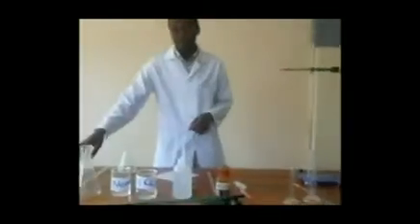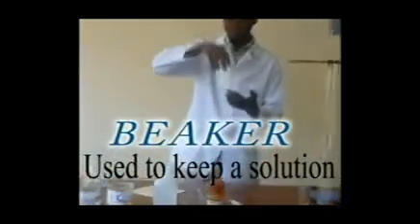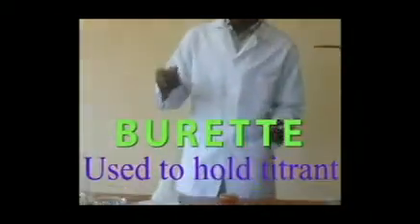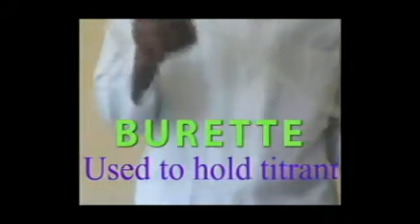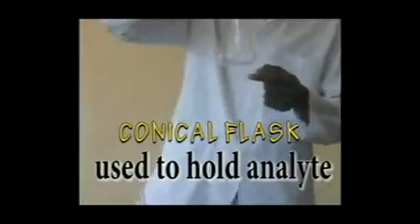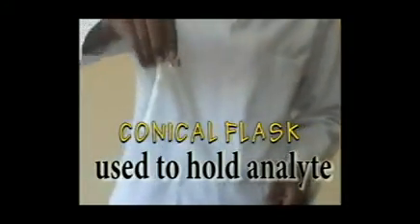Apparatus required. Apparatus required in this titration are: beaker, an apparatus that is used to keep a solution. Another apparatus is burette. This is an apparatus that is used to hold the titrant. Another apparatus is conical flask. This is an apparatus that is used to hold the analyte.